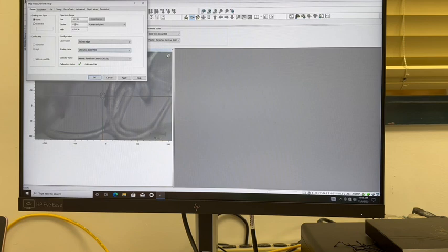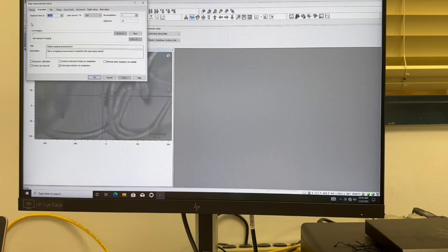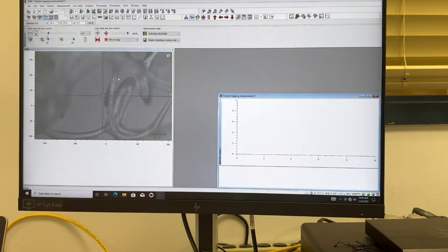After you have set the area, you will then continue to set up the spectral acquisition measurement template. It is important to note that a static scan should be done when doing mapping measurements, as an extended scan will take a significantly long time. You can choose the exposure time, laser power, and accumulations according to your material's parameters.